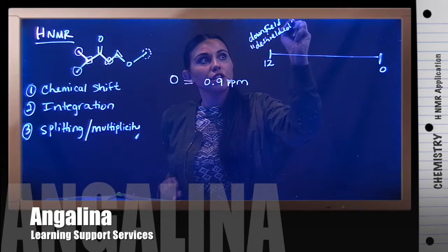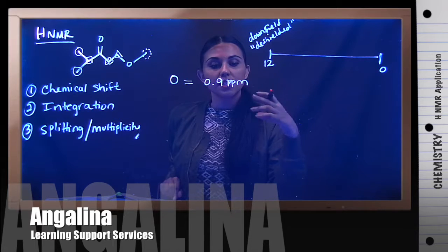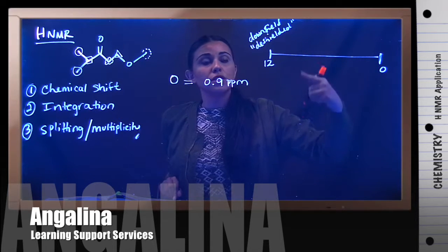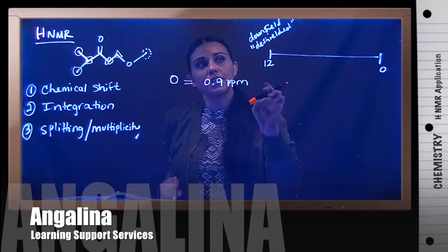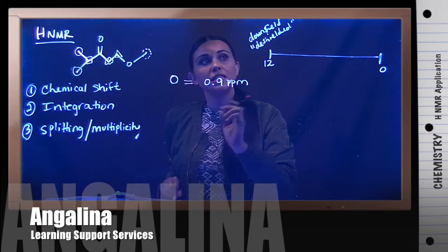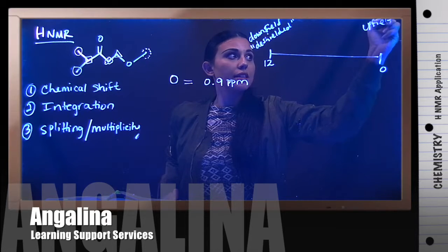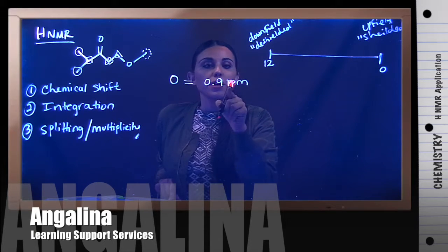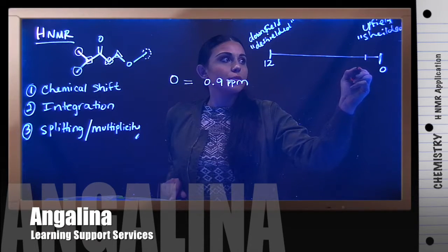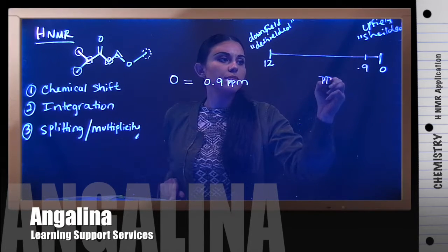Deshielded means that these electrons have more electronegative pull, so they're more susceptible to the magnetic field surrounding them. They're not protected as much because they're close to other electronegative atoms that are pulling the electron density away, deshielding them. This is going to be upfield, and these are going to be more shielded. So 0.9 ppm is somewhere around here, and that's pretty shielded, so that's usually where we see our methyl groups, and this is of course ppm.